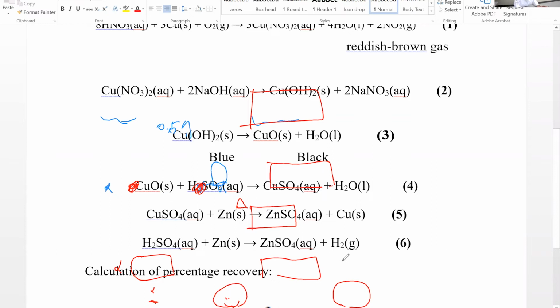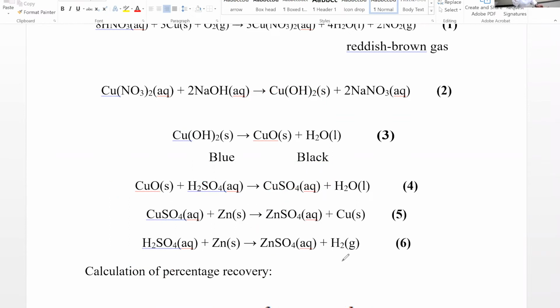So you would perform all these reactions in different steps following the procedure. You watch the video how it's done. You are going to learn about the different types of reactions, and you are going to also learn about techniques like filtration, drying the sample with the heating lamp, or heating up the solution using the setup with the Bunsen burner to boil the sample.